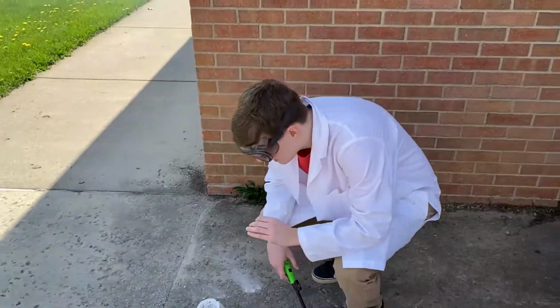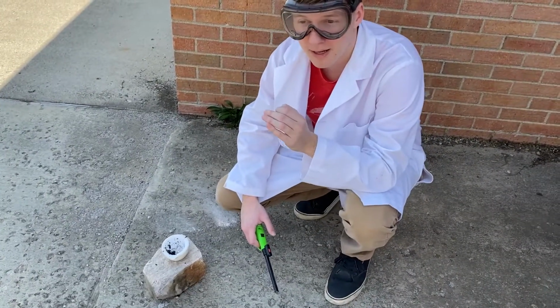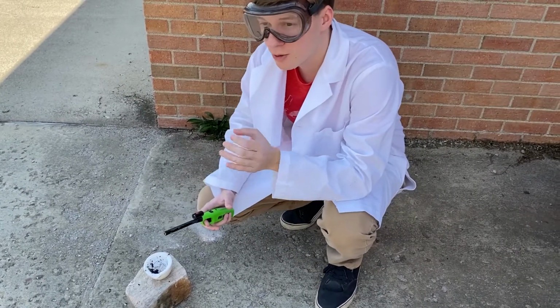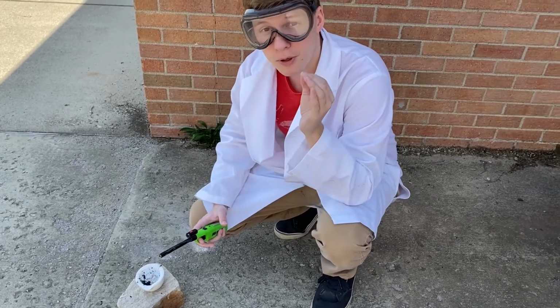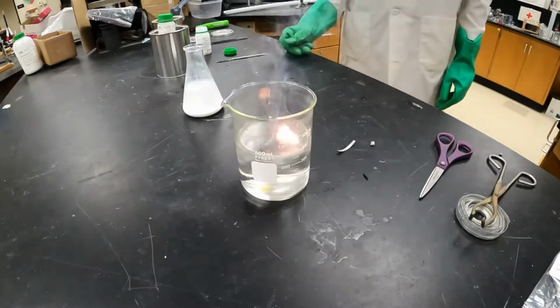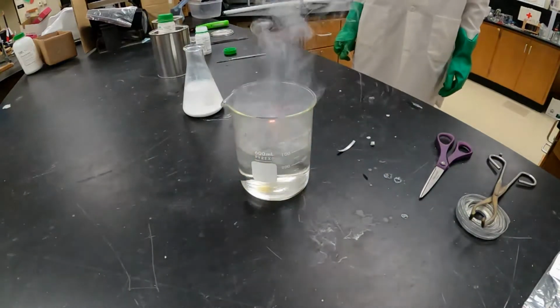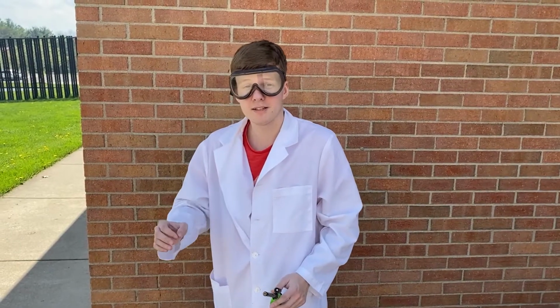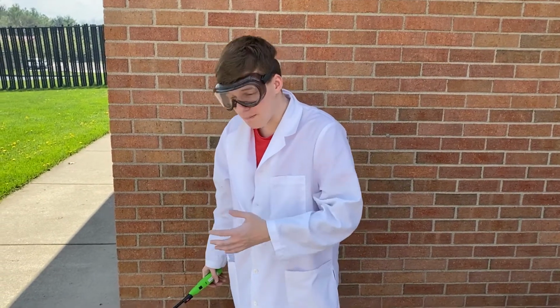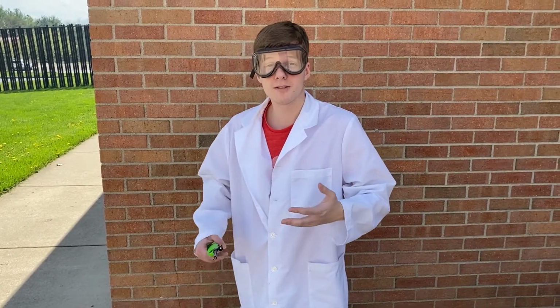Now, if you paid extra close, careful attention there, you will notice that it actually was a purple flame. If you think back to our previous videos, was there any other time that you saw a purple flame? You might think back to our alkali metal video when we took pure potassium and put it directly in water and it ignited almost immediately, and you saw a little bit of a purple violet flame being produced. That's the same thing that we just saw right there, because remember, our oxidizer in this case is potassium chlorate. If you have potassium in a compound, we are still going to get a little bit of that purple or violet flame. So that's a nice little fun fact as well.